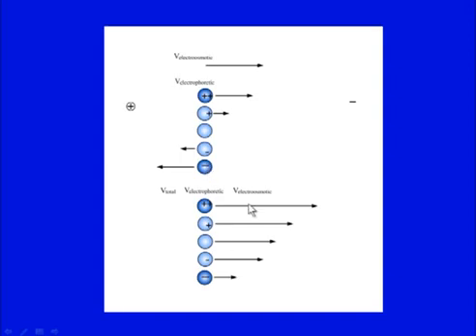So, what is the net flow here? The net flow is that the positively charged species in electroosmotic flow will move much faster, at the highest rate, followed by another positively charged species that carries less of the positive charge. Then it will be followed by neutral species, then negatively charged species, with less negative charge first and more negative charge after. So, less negative charge will follow the neutral, and more negative charge will resist the electroosmotic flow, but still it will move towards the cathode with the bulk solvent, that is, the drag of the bulk solvent.